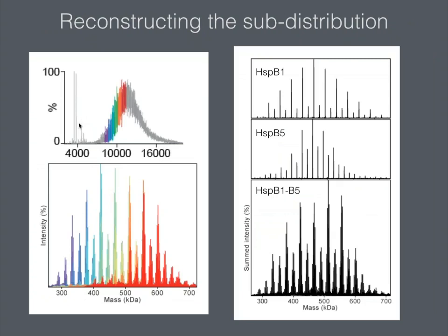So what we do after that, rather than just interrogating one slice and stopping, is we do a range of slices and obtain similar mass distributions for each of them. What we were able to do in this experiment was to interrogate something approaching half of the overall oligomeric distribution. At the higher mass end, above around 11,000 mass to charge, it became too difficult to actually do that mass spectrometry experiment.